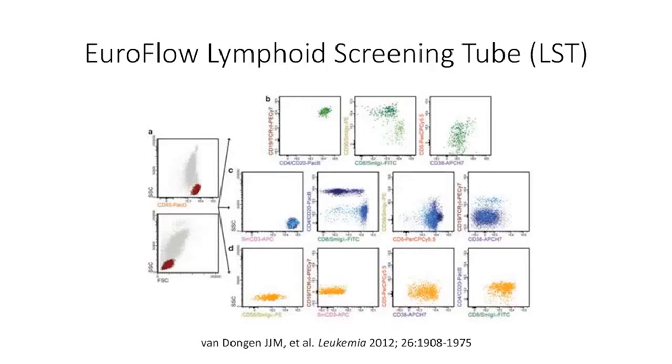They also express CD38 and variable CD8. The EuroFlow group has validated this tube with a large number of normal and abnormal cases, in particular using their dedicated software, which incorporates principal component analysis, and it identifies abnormal B, T, and NK cells in a preponderance of cases that have been studied.